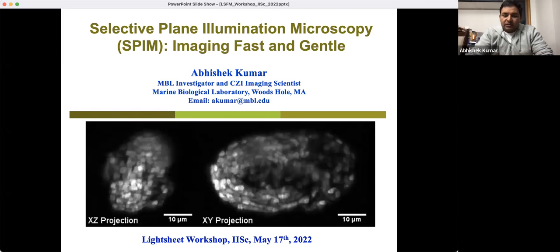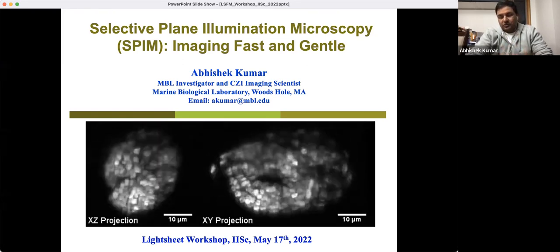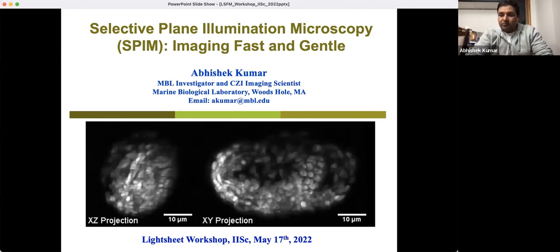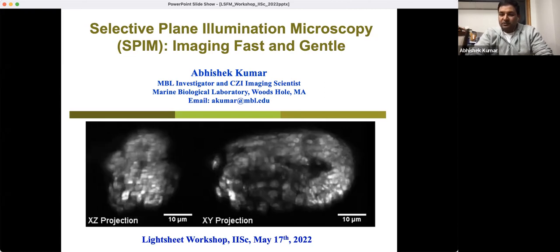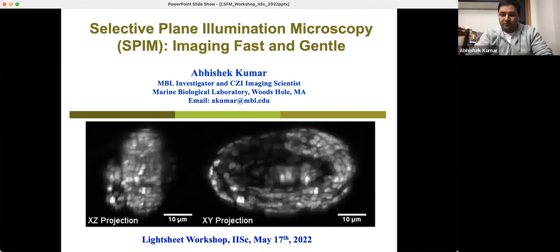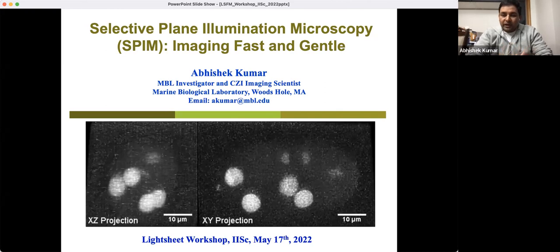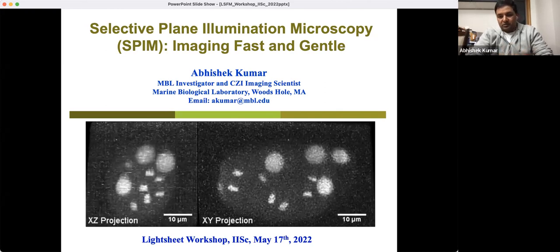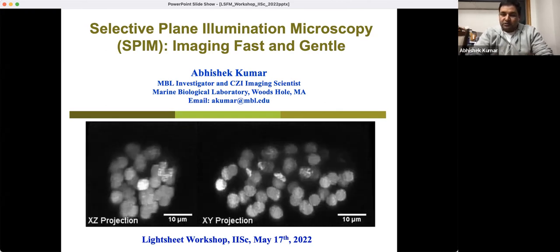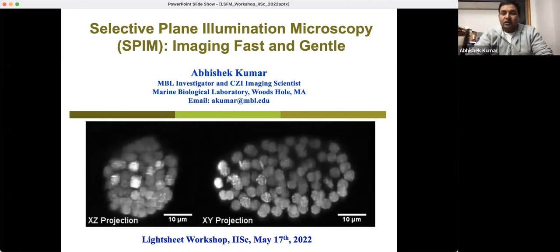And the other aspect is, for many applications, we want more isotropic resolution, whether it's for visualization or for finding blobs or cells or nuclei, or for tracking in 3, or rather 4 dimensions. 3 dimensions are space and the 4th dimension is time. So we will talk about how light sheet microscopy, or this modality, enables us to do such imaging.